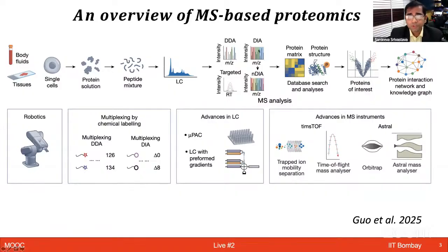Then the newer approaches came, which is known as DIA, data independent acquisition, where the idea is, since we have peptides eluting at different m/z, starting let's say from 300 to 1300 m/z, where most of our peptides will be seen, we can take small windows of 300 to 400, 400 to 500, and likewise go up to let's say 1300. And what you see now, those colors, like you are looking at every precursor in that m/z window, not only picking up the most intense ones, right?